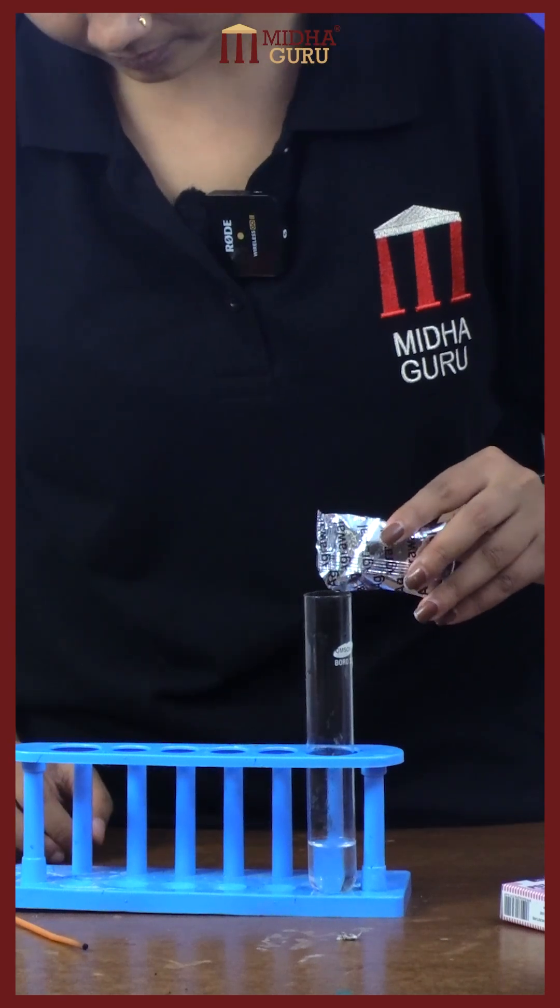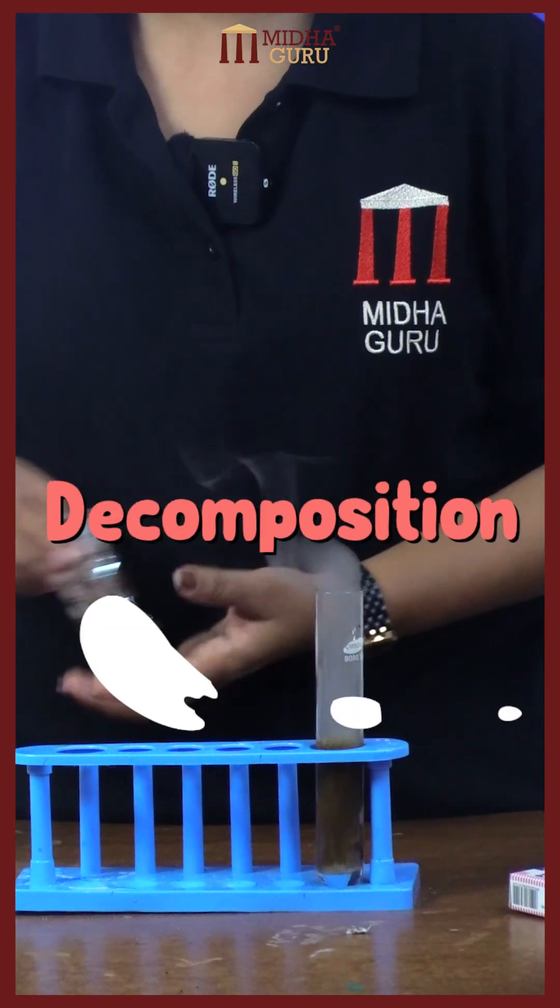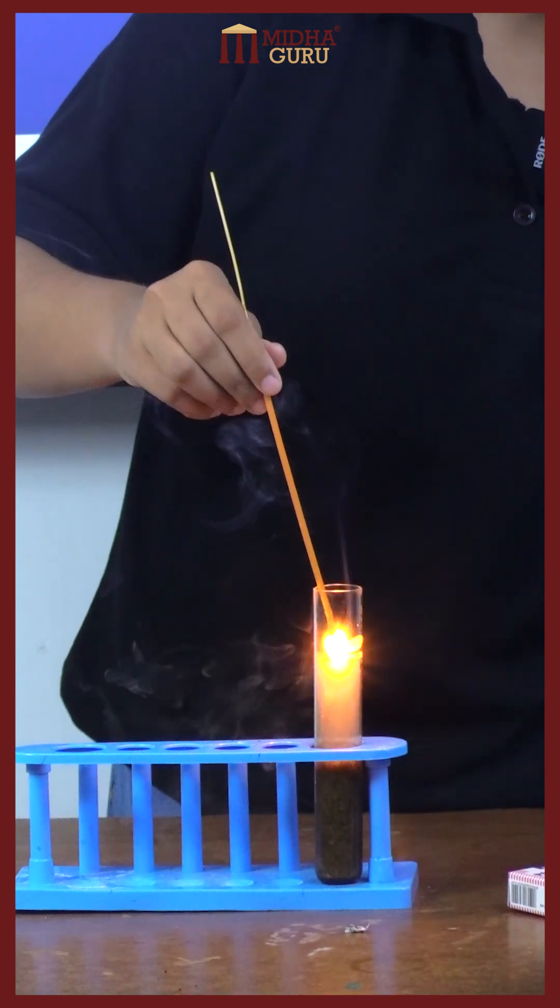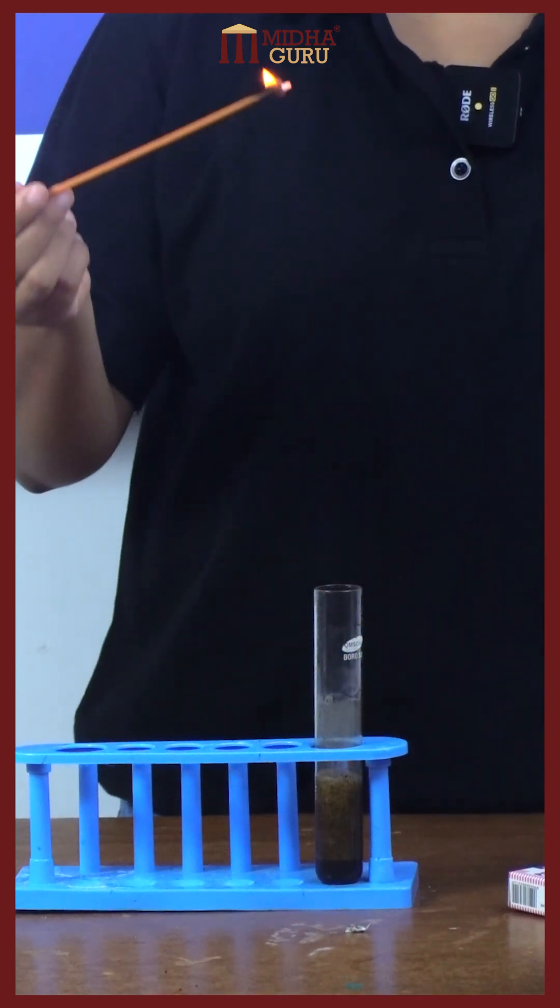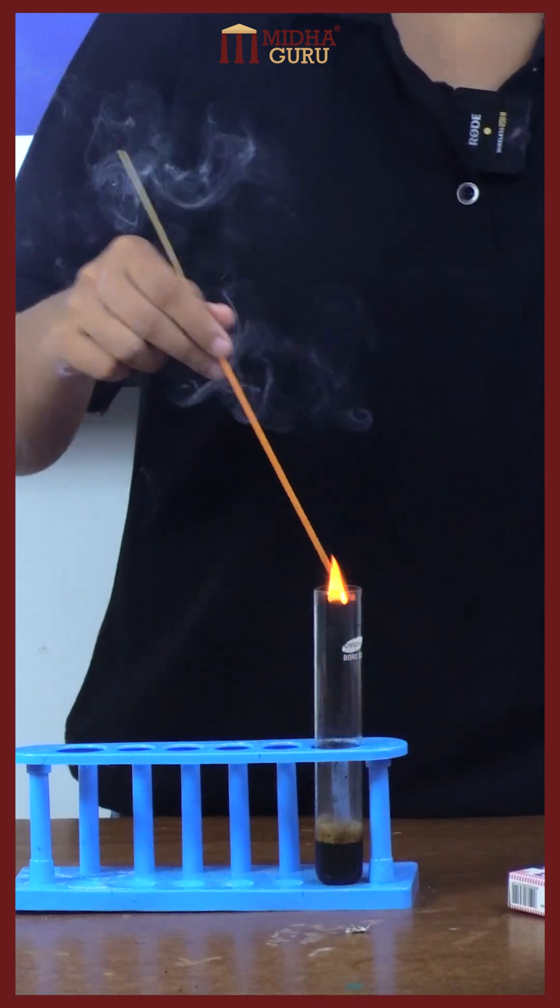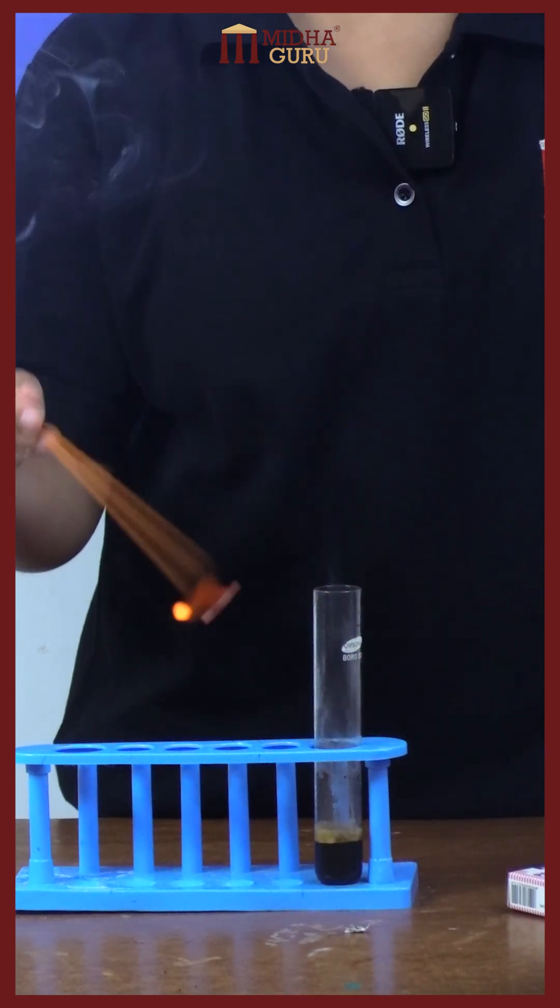The reaction that you see here is a type of decomposition reaction going on in the test tube, and it is highly exothermic, so it is not recommended to do this at your home. When I bring a lit incense stick near the test tube, it lights up again. In this decomposition reaction, there is evolution of oxygen gas and water vapor.